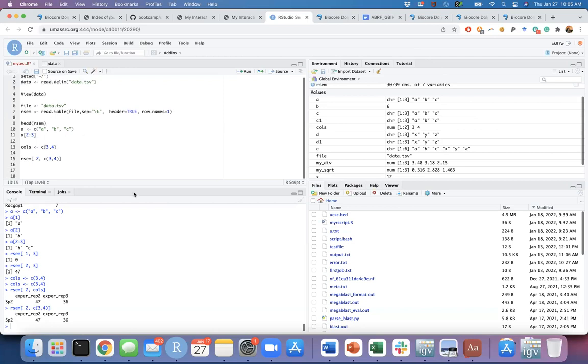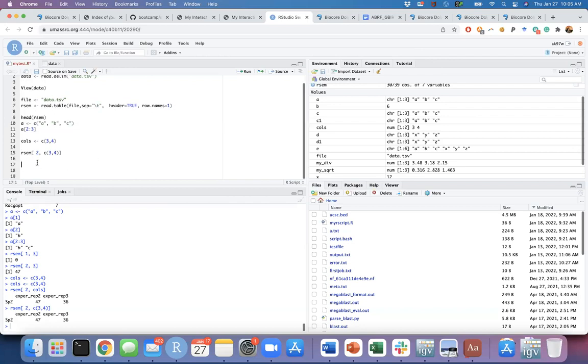Okay. So now let's move on a little bit more to how we can access using their names. To be able to access some gene names, for example, if you want to see genes of interest, like my genes, you can create such a thing.